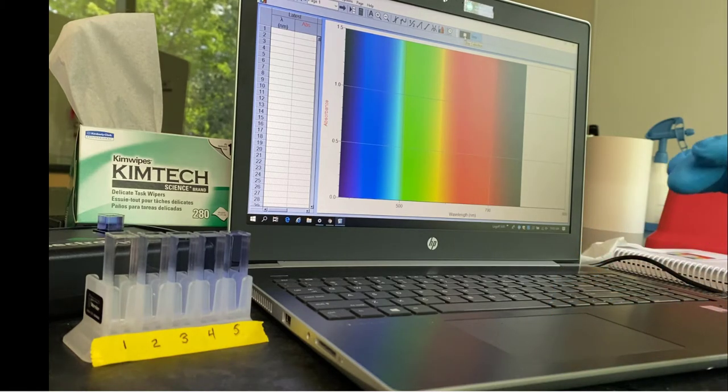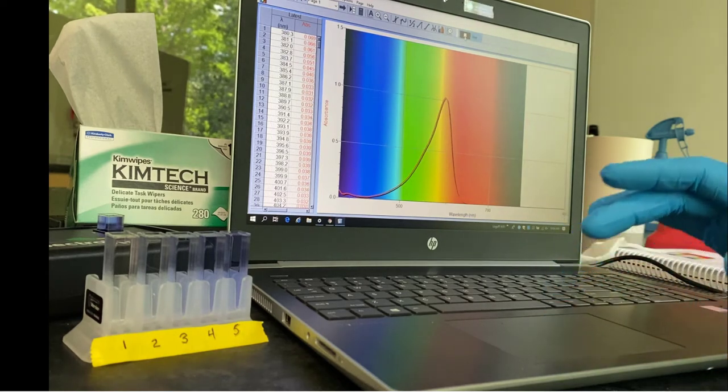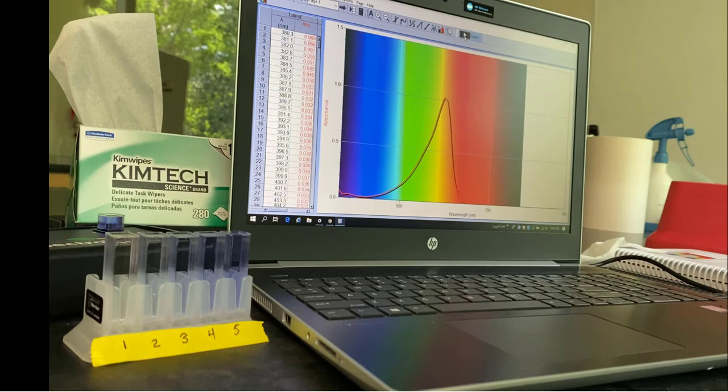Now I'm going to tell the computer to collect data and it's going to generate an absorption spectrum for bromophenol blue. So you can see it's absorbing mostly there, the peak is in the yellow and the orange.